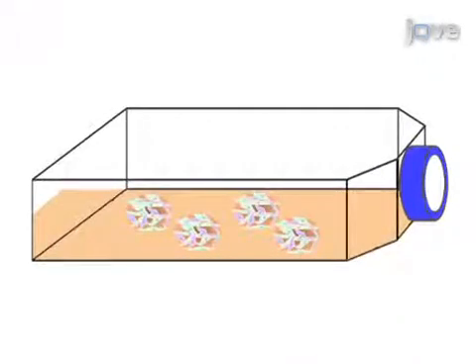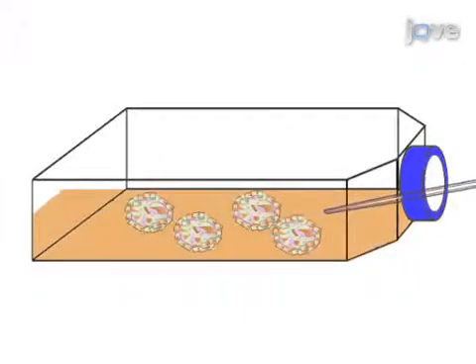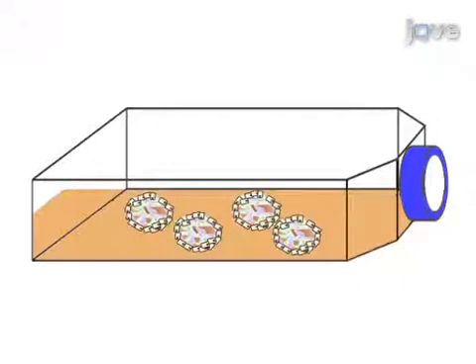Then, to recreate the in vivo architecture and complex cell-cell interactions present in the ovary, co-culture epithelial and stromal cell lines in three-dimensional spheroid models.